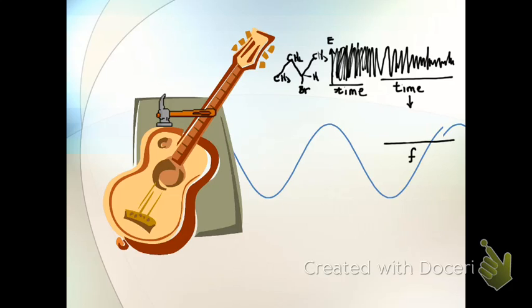If there are really just 4 signals in this compound, we expect to see 4 different signals based on the energy of each. The relative area under each of those lines would be representative of the number of hydrogens in that compound.